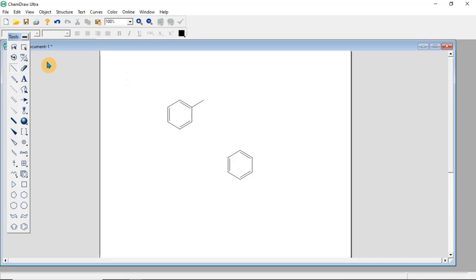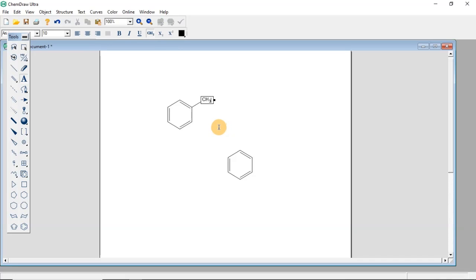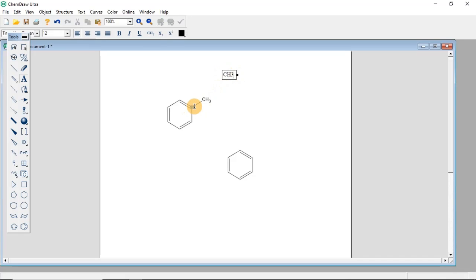At the end of the chain, come and click on the text tool, then type something like CH3. ChemDraw has a chemical intelligence that automatically makes the subscript number appear as a subscript at the end of a chain. If you type CH3 on a blank area it appears normally, but inserted at the end of a chain the 3 becomes a subscript automatically. To change it manually as in Microsoft Word, select the subscript button and type the number.